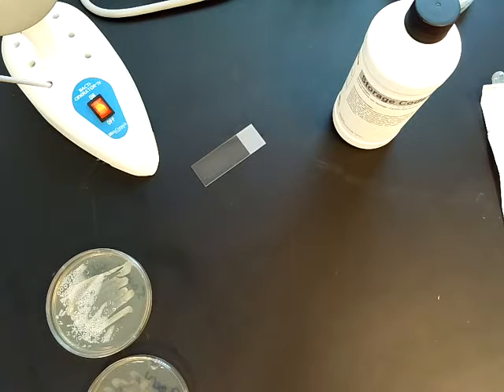In this video, I'm going to talk about the catalase test. So catalase is an enzyme that's released by microorganisms in order to help protect themselves against hydrogen peroxide. Hydrogen peroxide is a waste product. It is the result of cellular respiration.